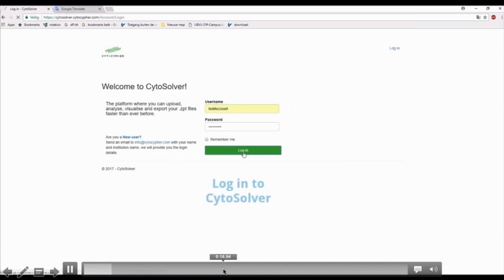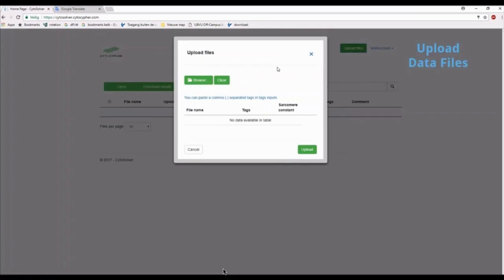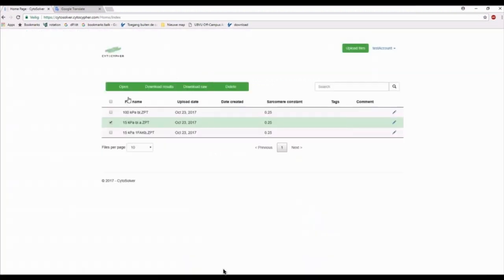So the data analysis. You have to sign in, of course. This is the web version. You have to upload files. You select the files you want to measure, in this case 3. You open it. You have to add a few constants. Upload it. Uploading actually takes some time depending on how many files you load. We saved that time by cutting it out of the movie. In the case of the 400 cells, that is the part that took slightly less than 2 minutes. If you have fewer cells, then it takes 10, 20, 30 seconds. And of course, that also depends on your computer and your internet connection.